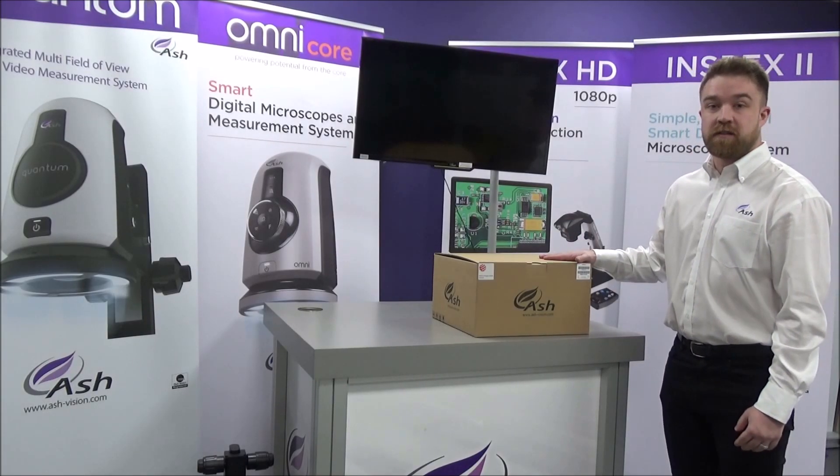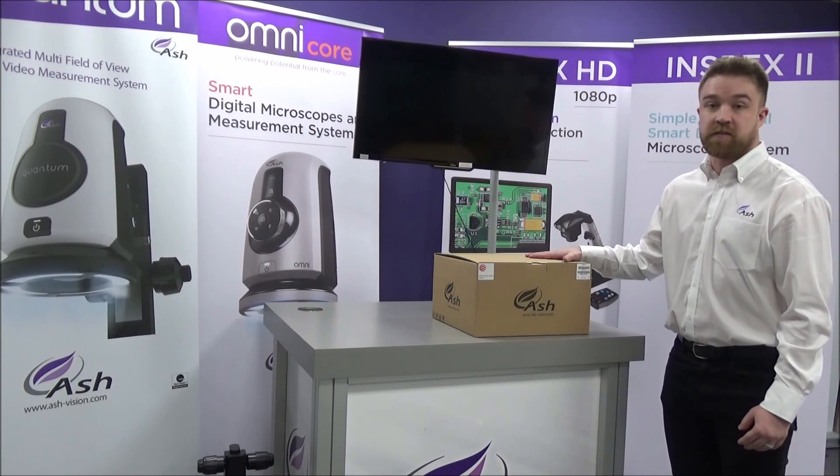So next I'm going to show you the contents and what comes with the InSpecs 2 inside this box.